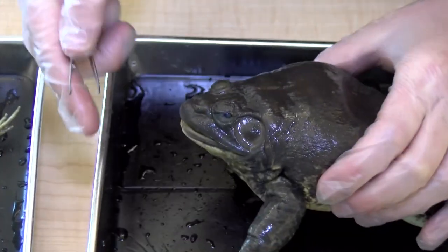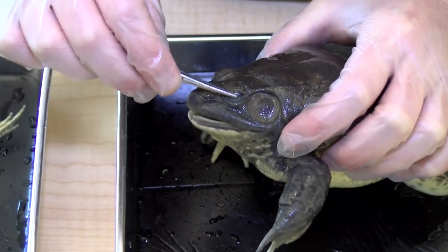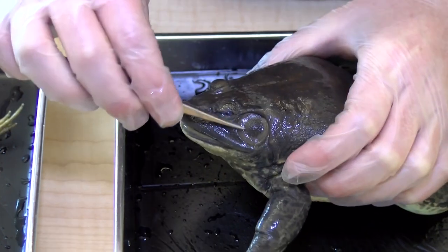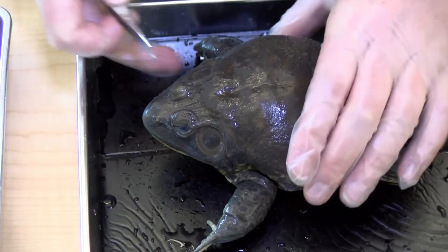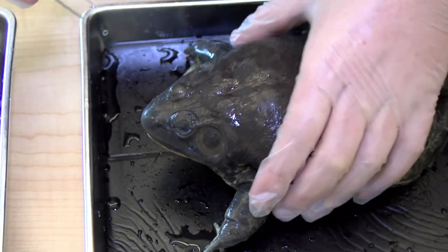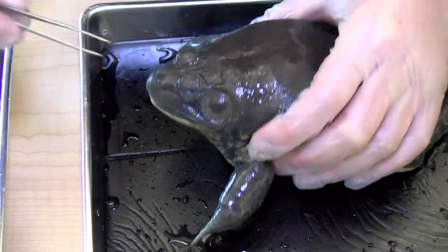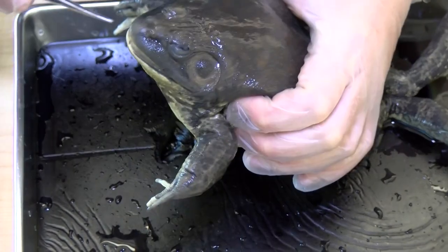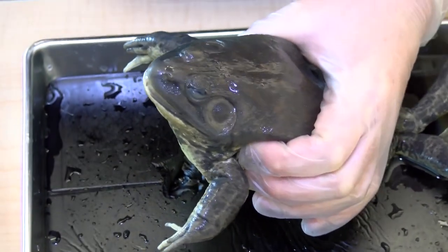You'll notice that the frog's eyes are at the front and they've got a coating over them. These circles back here are known as the tympanic membrane, and that has to do with hearing. At the front, these are the nares, which function like the frog's nose.